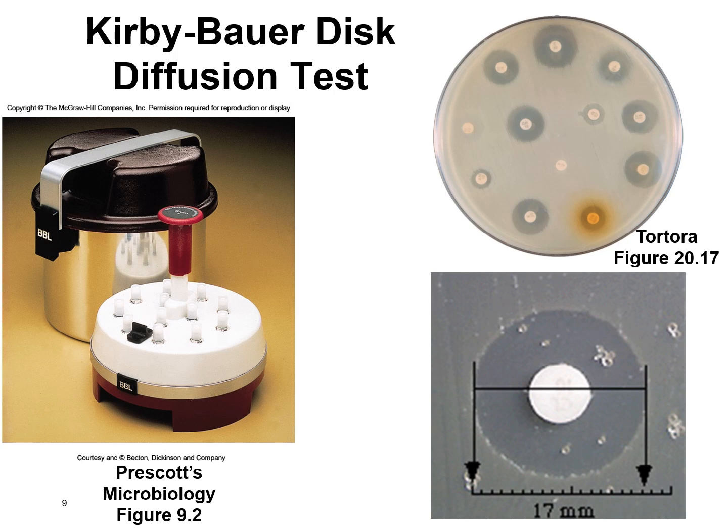So what's happened is that closer around the disc, you've got a higher amount of antibiotic, and then as you move further away, the antibiotic levels get lower. And so you have a much lower MIC out here than you would, for example, on this one. This antibiotic would have a higher MIC because you're closer to that disc, so you have a higher concentration of antibiotic that's needed to kill the bacteria. So the larger the zone of inhibition, the lower the MIC, and the better that antibiotic is going to work. So this antibiotic would work better than this one, and definitely much better than this one, which didn't even kill the bacteria at all.